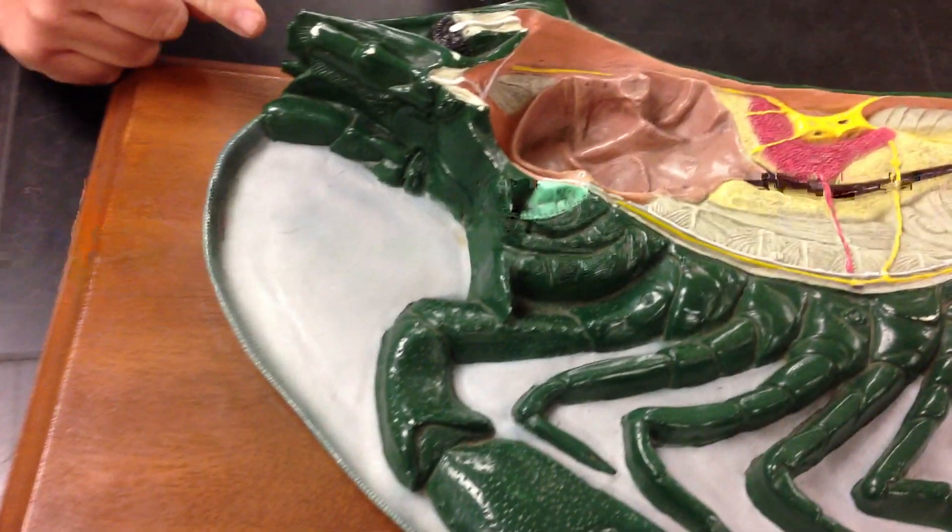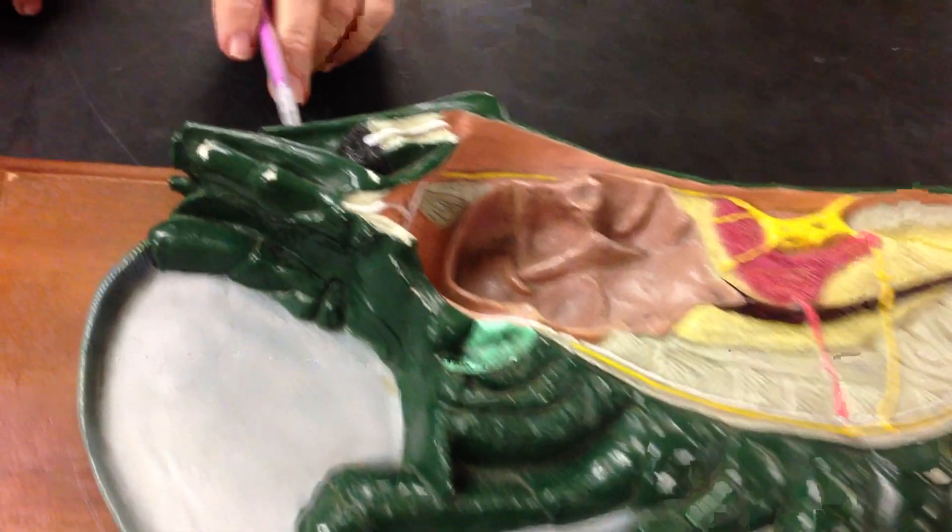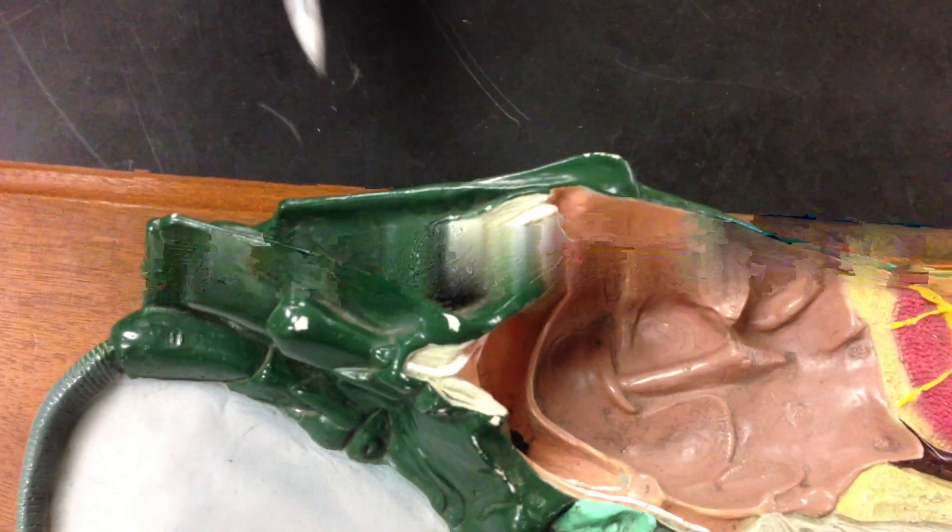Here's the antenna — you can see it goes all the way around. Here's the rostrum and the compound eye.